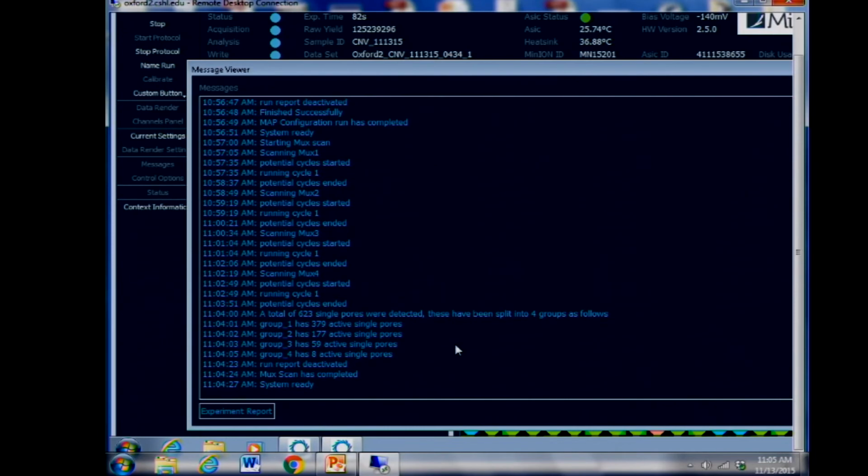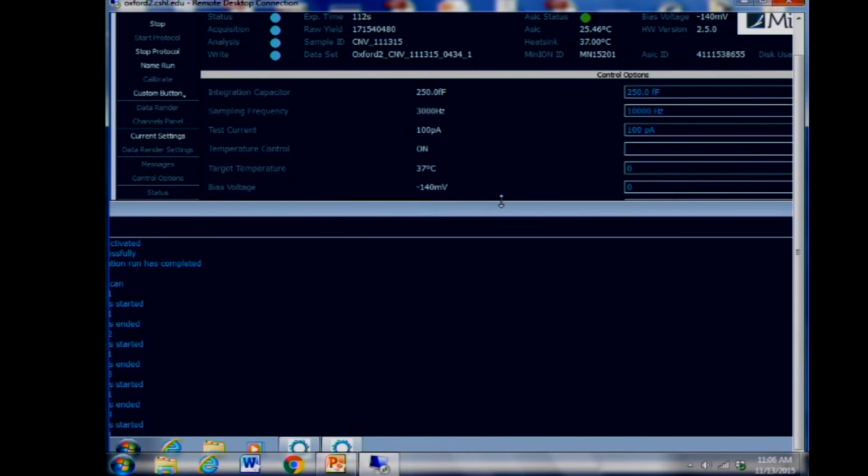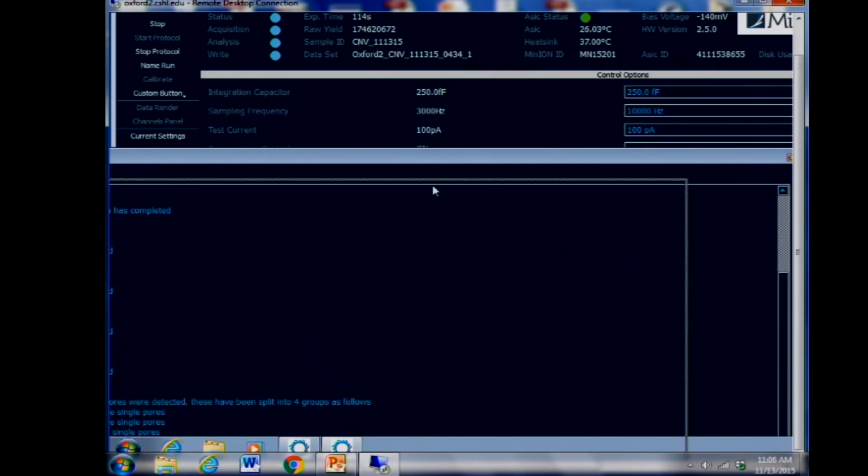Okay. Now, what we hope to see usually is this value is over 450, and this value here is hopefully pretty darn close also to 450. The big jump here that we see indicates to me that this flow cell is probably not going to perform up to what I would think is good, which is unfortunate, but you have to deal with what you have. With a new technology like this one, you have to be willing to accept that sometimes things are not going to work as well as you would like, especially when trying out a new protocol.